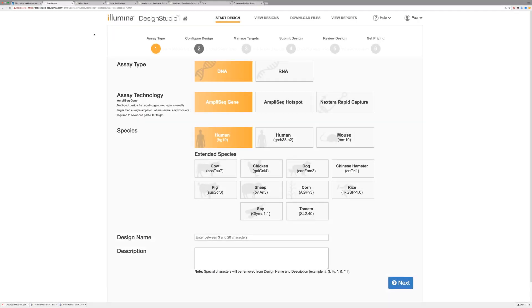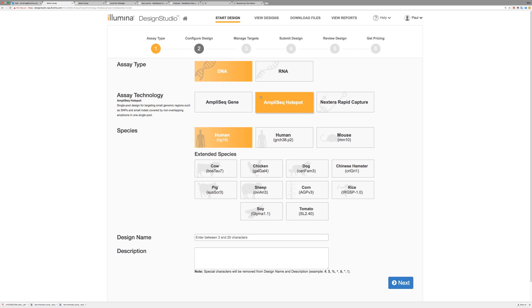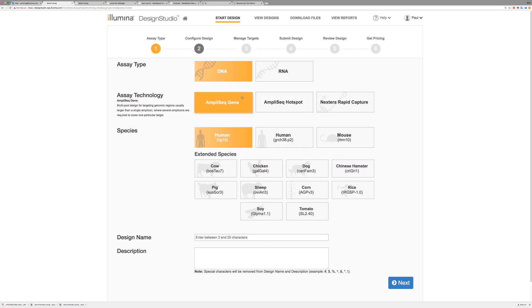You can play around and create as many designs as you want. First, start your design and choose your assay type, which will either be AmpliSeq for Illumina gene design or AmpliSeq for Illumina DNA hotspot. In this case, we're selecting AmpliSeq for Illumina DNA gene design. Hotspot is always one pool, and a majority of gene designs are two-pool designs.